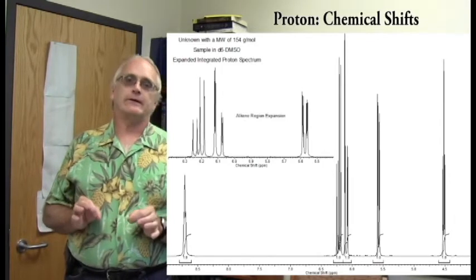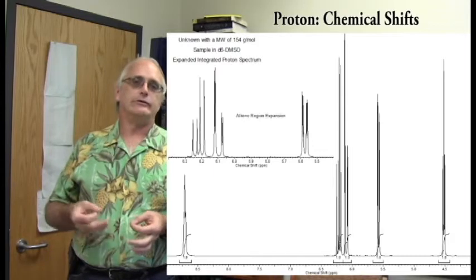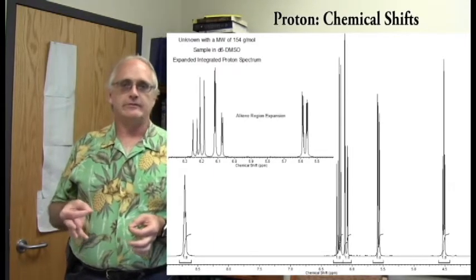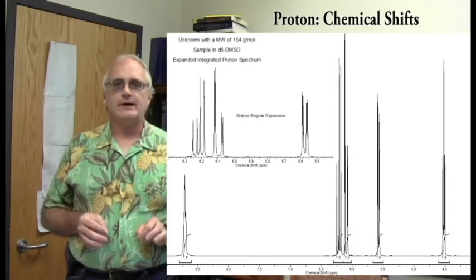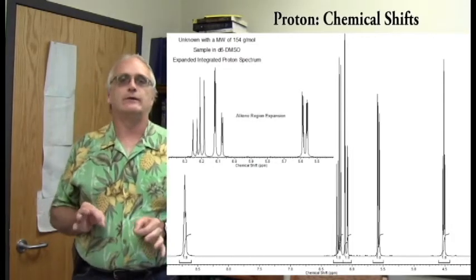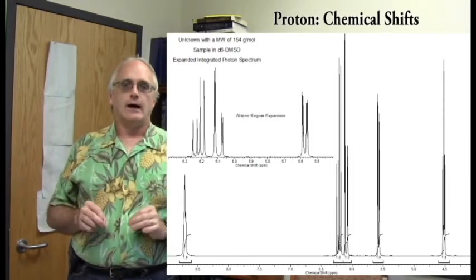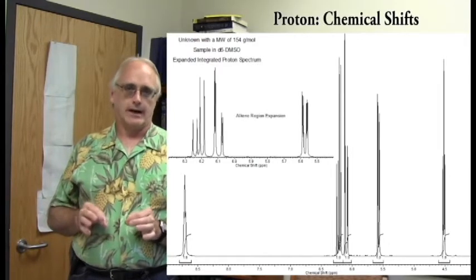The chemical shifts are interesting. 4.5 is our sign of a hydrogen near a heteroatom. We've seen them plenty of times near oxygens in the realm around 4. At 4.5, it's a little on the high side, but it's still within range. So we're going to keep that hydrogen near oxygen or other heteroatom in mind.